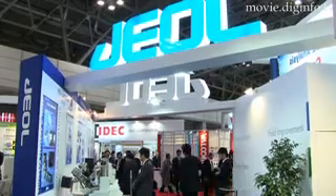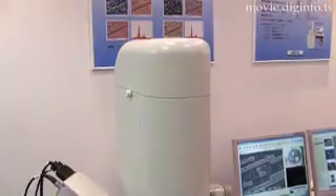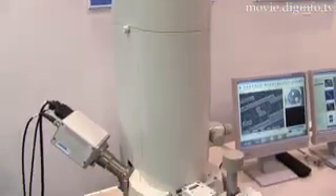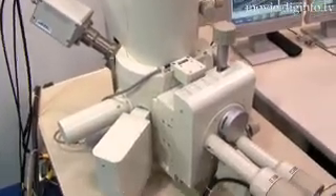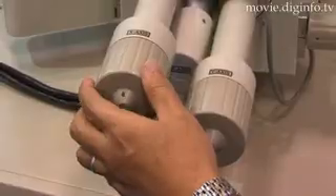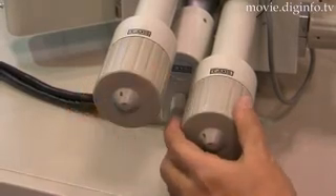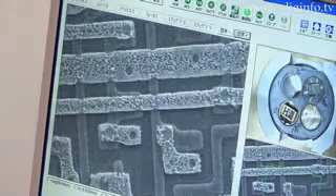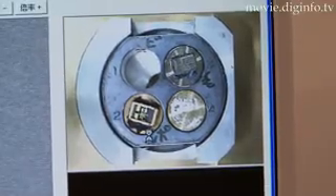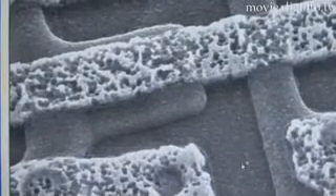The JCM-5700 CarryScope, developed by JEOL, is a stationary scanning electron microscope (SEM) that is both compact and portable, so that it can be easily carried to any site requiring SEM observation. It is designed with high throughput on par with optical microscopes for enhanced operability, and enables high resolution observations with a large focal depth that cannot be obtained with optical microscopes.